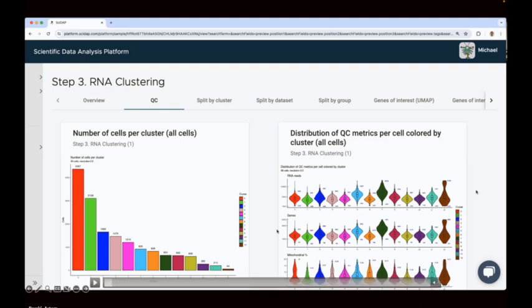More damning would probably be mitochondrial percentage. And so you will be able to see how this is distributed on these violin plots, as well as in UMAPs on the browser. And again, you will be able to ask yourself the same question: is it reasonable to think that this cell has a lot of mitochondrial RNA, or maybe it is a dead cell and all the RNA has flown away and we only have mitochondria left?